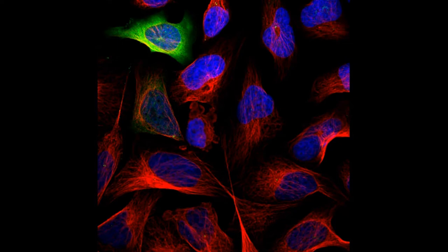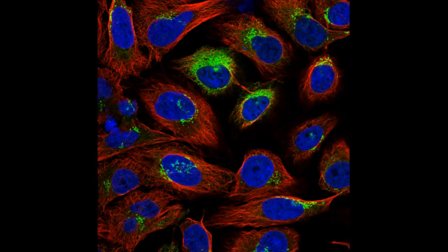And sometimes we see complete translocations of a protein. Here we can see a protein localized to the Golgi apparatus in all cells, except in the two cells that have just divided, where the protein is localized to the endoplasmic reticulum. So even though these are static images, this kind of variation between the cells in the image indicates that there is a dynamic behavior of the expression of this protein. And there can be many reasons for this dynamic behavior, but one plausible reason is that it could be correlated to cell cycle progression, since these are non-synchronized log phase growing cells.